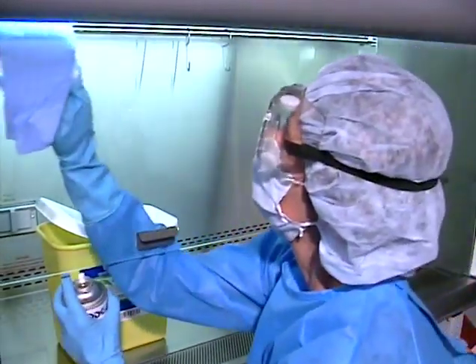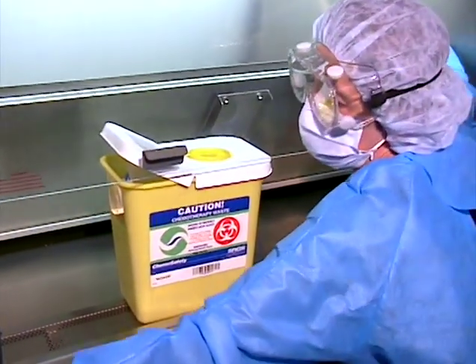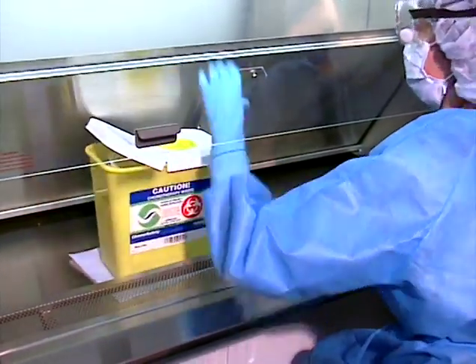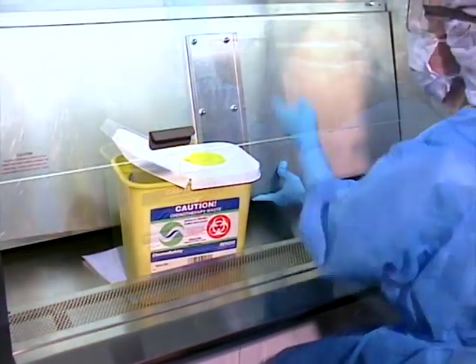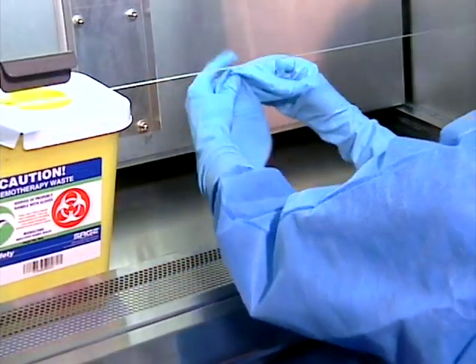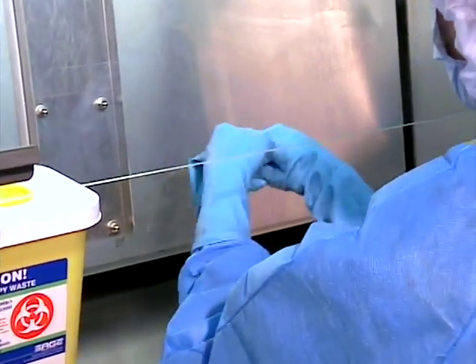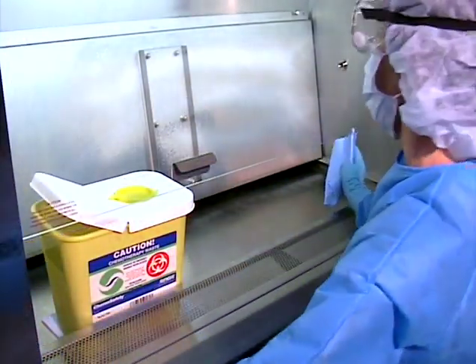Pick up the waste container with the clean hand and lift the tray far enough to access the under tray area with the dirty hand. Place the waste container on the front grill and place a new chemo mat in the under tray. Set the waste container on the mat. Lift the work tray and prop it against the back wall of the cabinet. Change the outer pair of gloves, which may have become contaminated while handling the work tray, and clean the back side of the work tray, again keeping one hand clean and using the other to wipe.